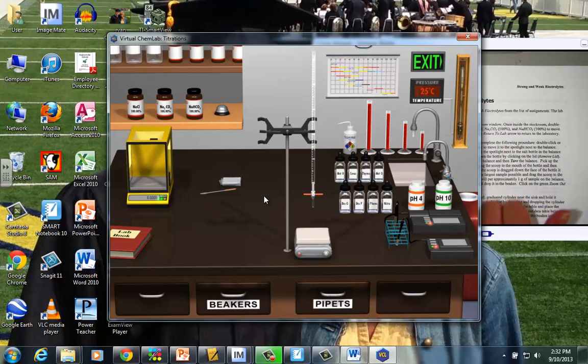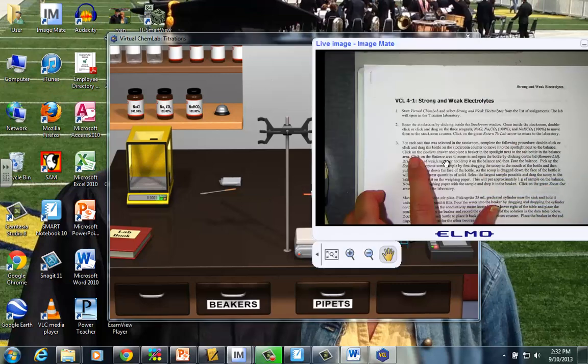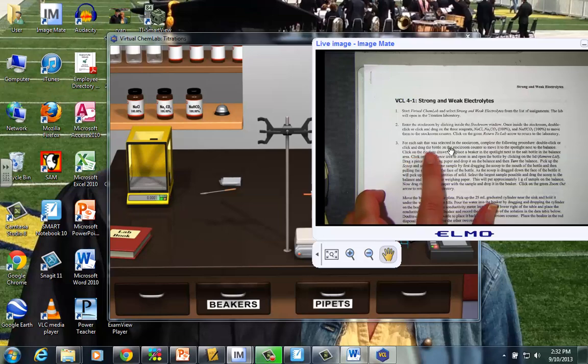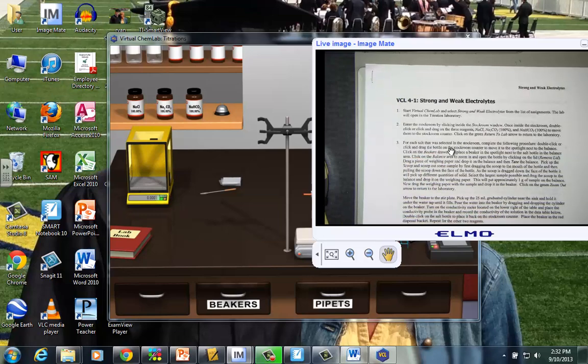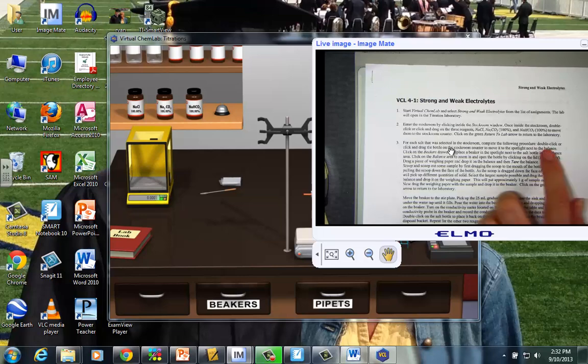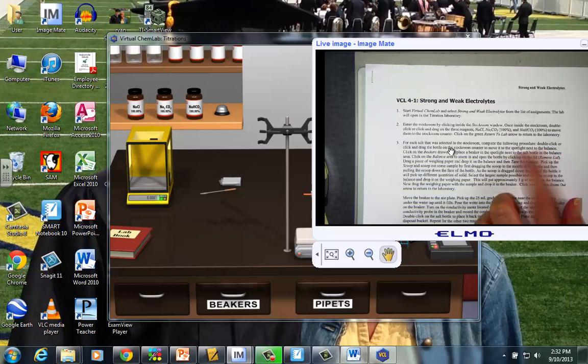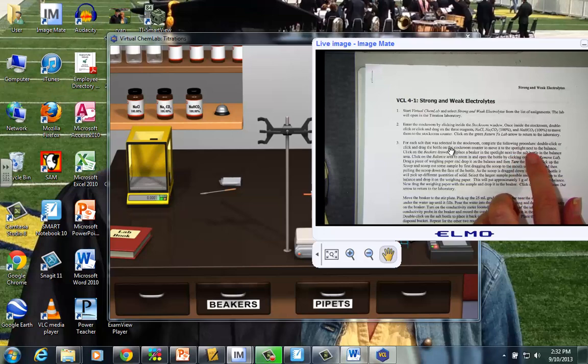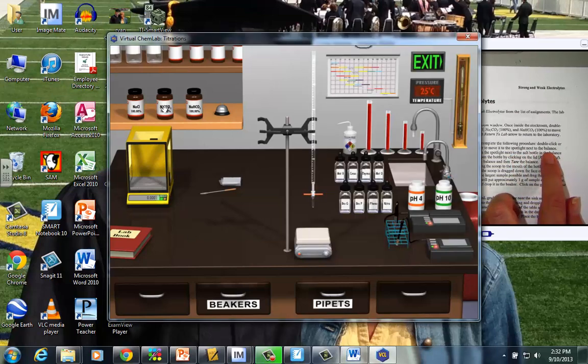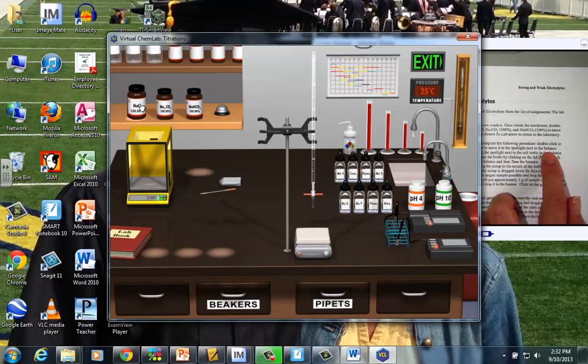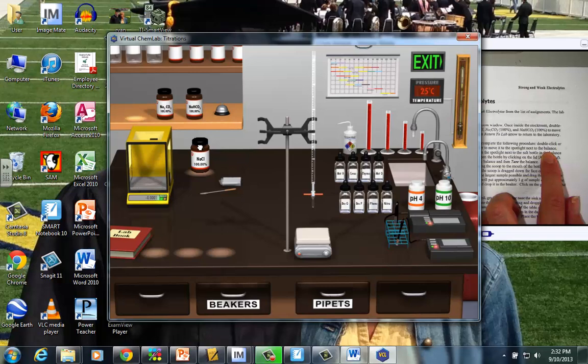Going on to step three, and just kind of thinking where we are in terms of procedure. For each of these salts that were selected in the stock room, we're going to complete the following procedure. We want to double click and drag the bottle to the stock room counter, and just move it next to the balance. So let me model what to do there. Let's just test the sodium chloride first. So I put my cursor there, and I click it on, and just drag it to the highlighted area next to the analytical balance.